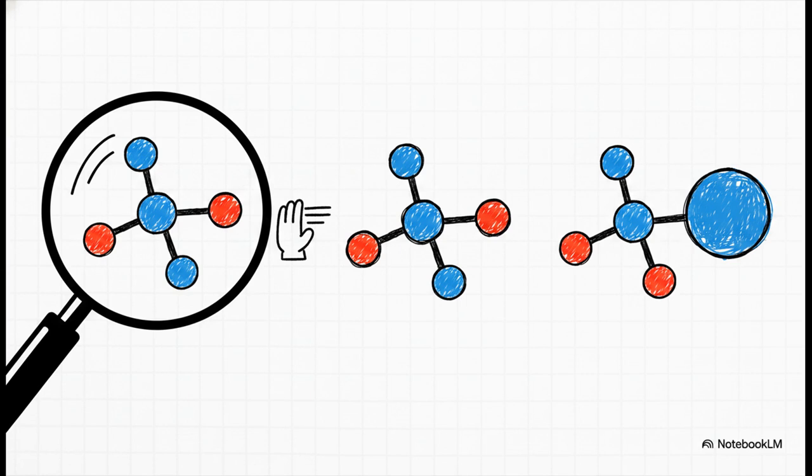We also got to watch out for decoys, specifically the M+1 and M+2 peaks. These are naturally occurring heavier isotopic twins that show up just slightly heavier than our true molecular ion. In reality, atoms aren't purely one mass. About 1.1% of carbon atoms are carbon-13. So in a huge sample, a tiny fraction will randomly contain a heavier carbon, creating a small peak 1 mass unit higher. And if the molecule has chlorine or bromine, you'll see a massive M+2 peak because heavier versions of those halogens are extremely common. We have to spot these natural decoys so we don't accidentally overestimate our suspect's weight.